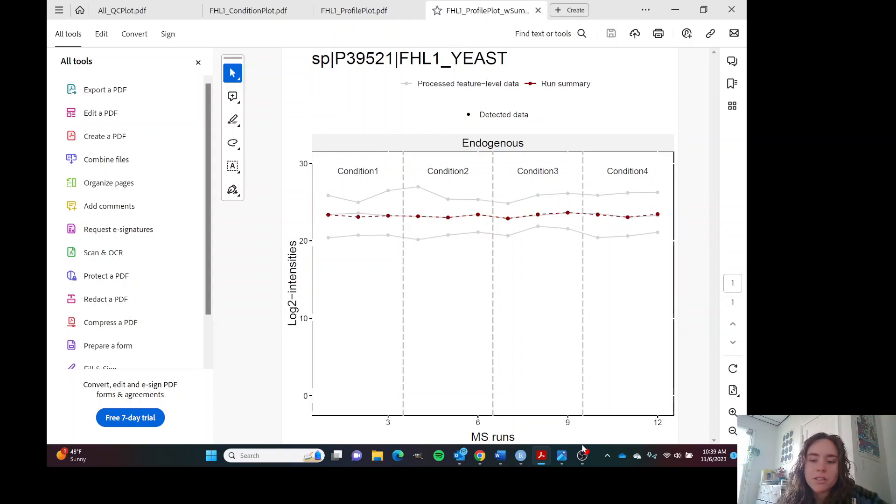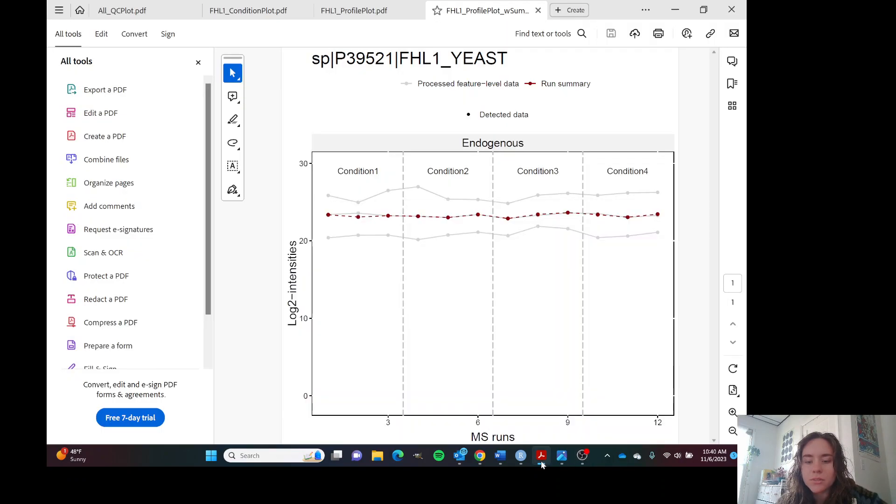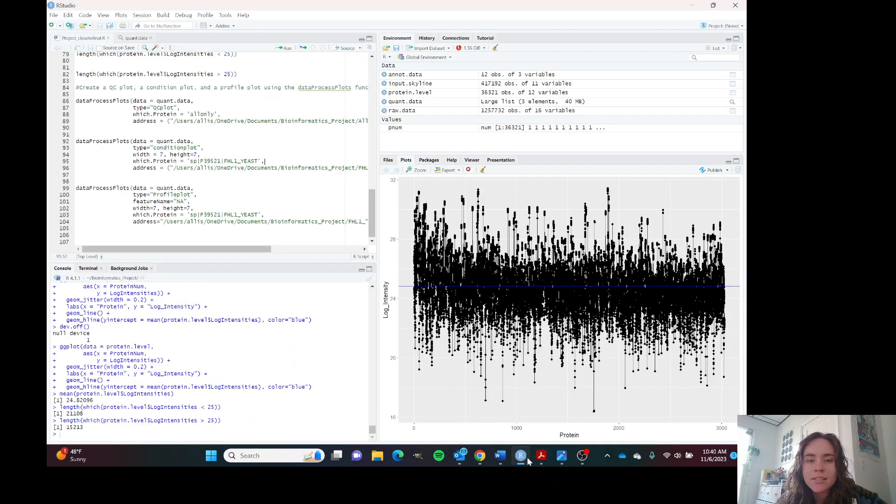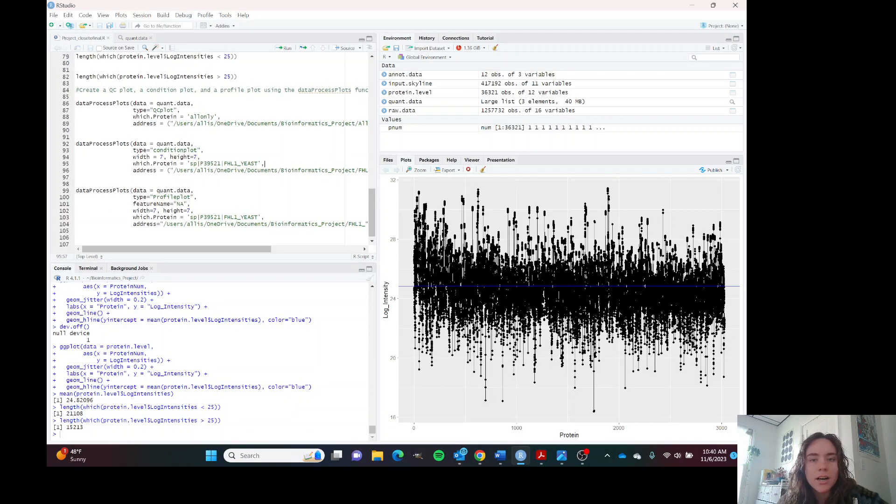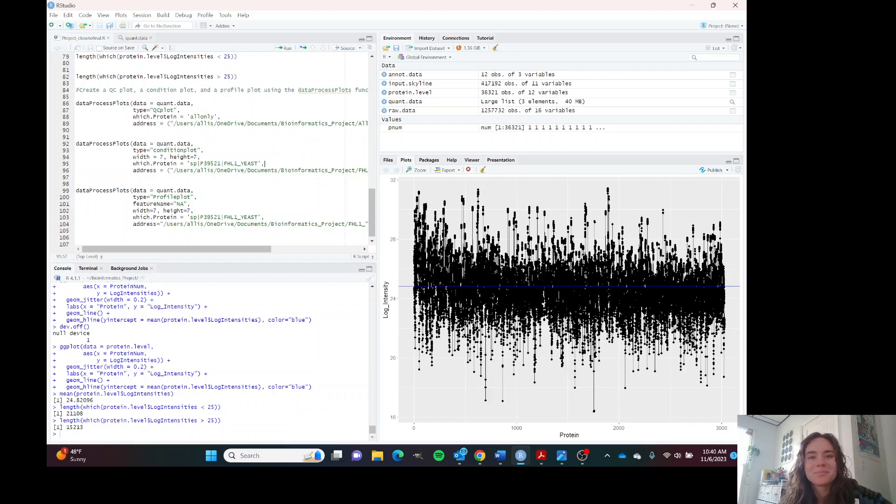These are the plots that we were able to make using MSStats and using ggplot. Thank you and let me know if you have any questions. My email is in my manual.